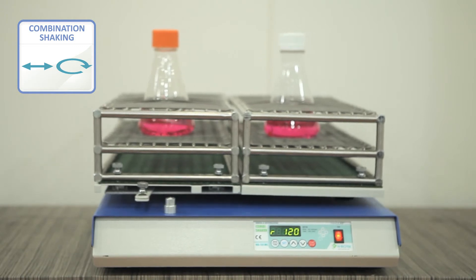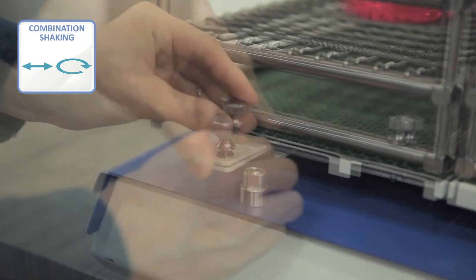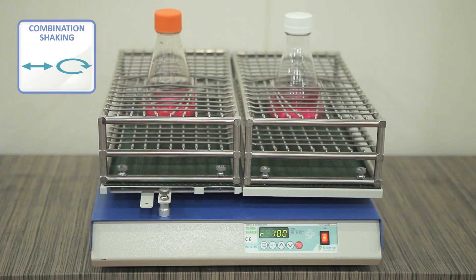NBiotech Shaker and NB101MC combination shaker enables simultaneous use of orbital and reciprocating motion with simple operation.